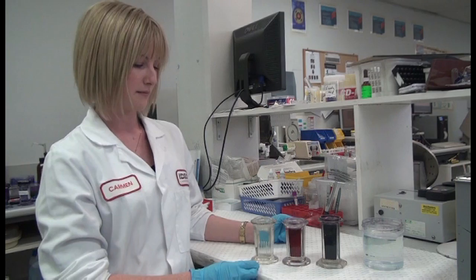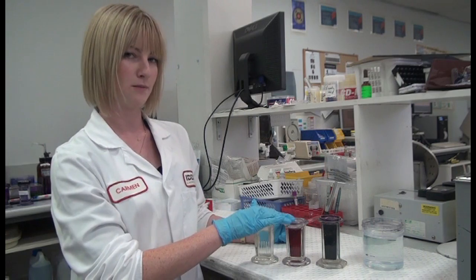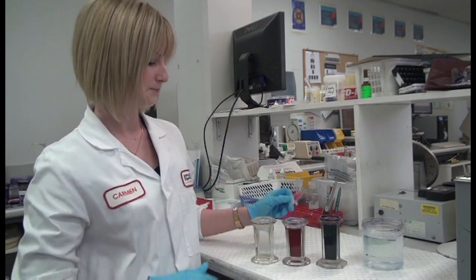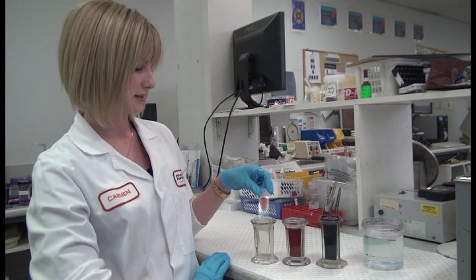I'll show you the Diff Quick method of staining. I've got my fixative, Quick Dip one, Quick Dip two, and some rinsing water. The first step is ten dips in the fixative.